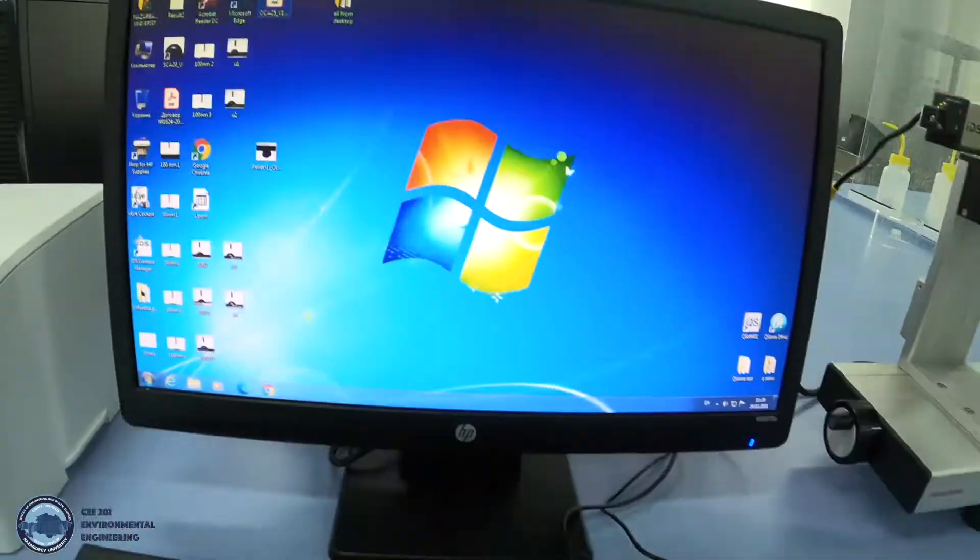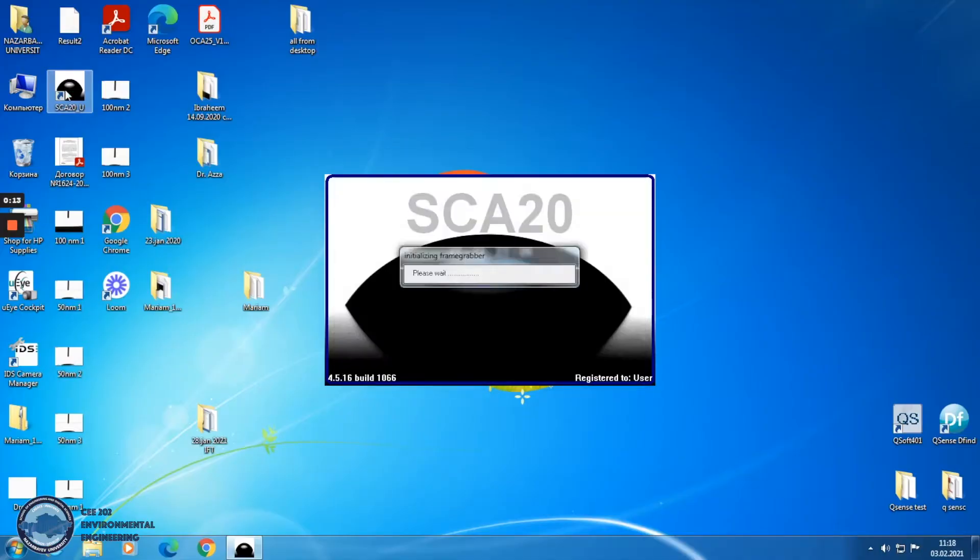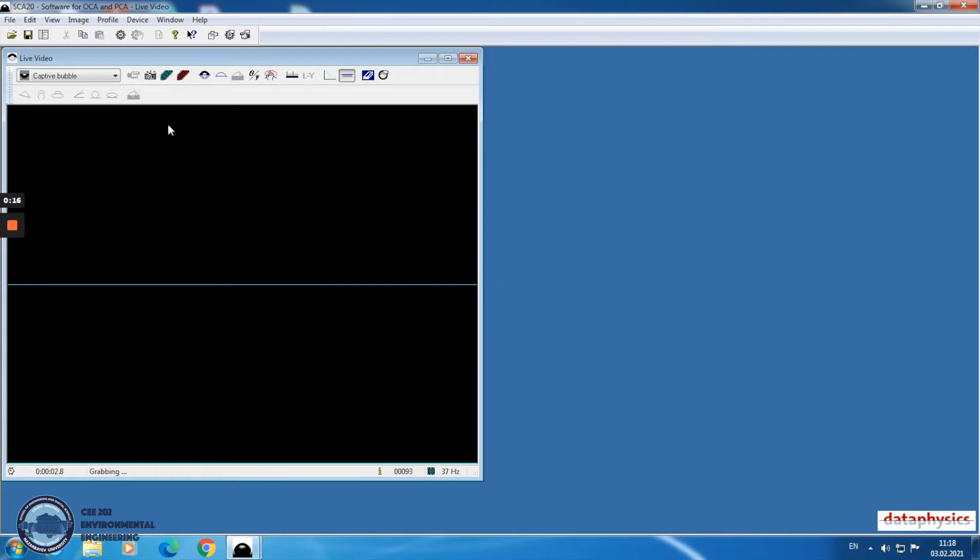Now we will launch Optical Contact Angle 20 program from the desktop. The program is now ready for use.